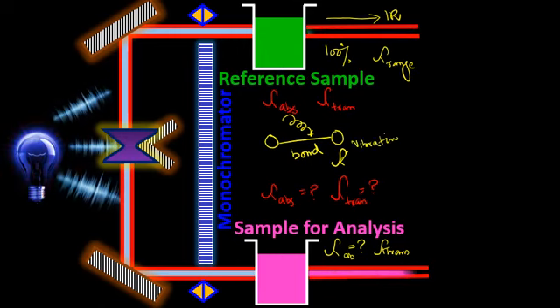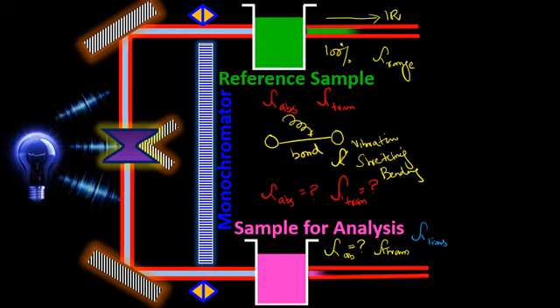It may be in the form of stretching or bending. This vibration is a result of the absorption of a specific wavelength of infrared radiation. So the rest of the infrared radiation, which is of different wavelength, will move along the forward direction in the form of transmitted infrared radiation.